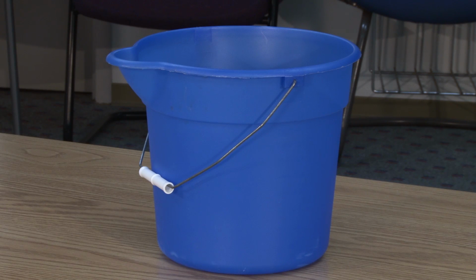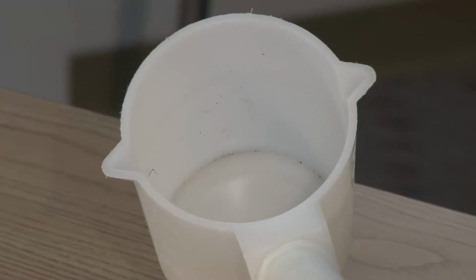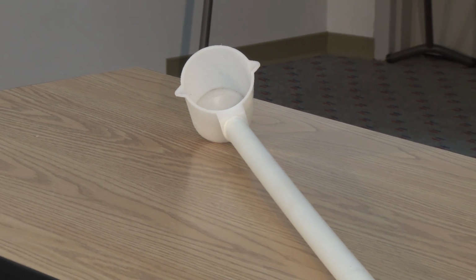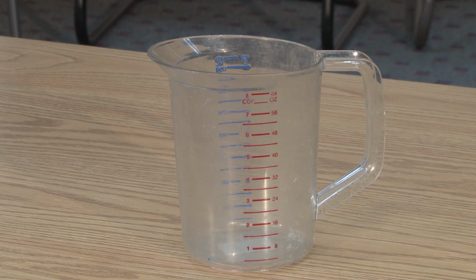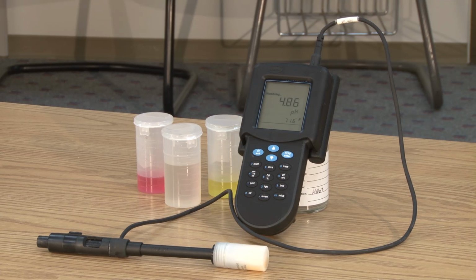a sampling bucket to physically collect the sample of stormwater from the discharge point or location and for preparing the composite sample, sample containers to be filled with the stormwater at specific time intervals, a sampling scoop to facilitate sampling from the collection site to the sample containers or sampling bucket, a graduated cylinder to measure portions of each sample during preparation of a composite sample, a rain gauge to collect rainfall data prior to and during the sampling event, a pH meter to test the acidity of the stormwater samples.